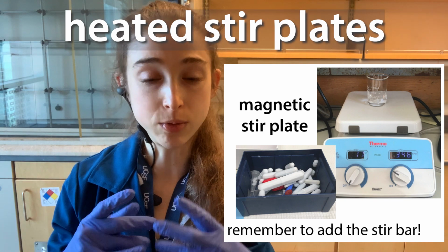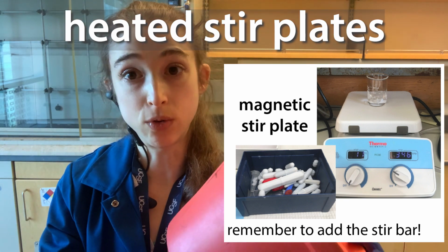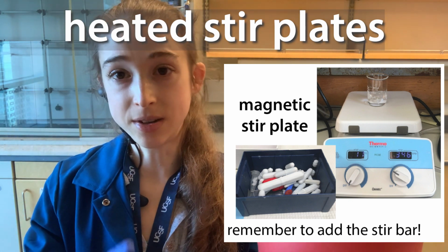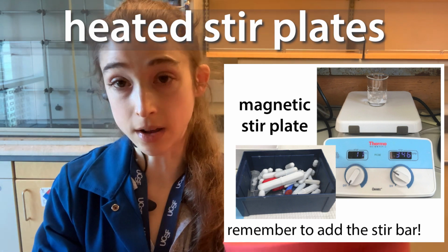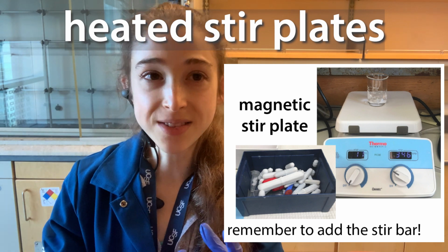Never put something on the hot plate, even if it's off, for storage, or if you're going to walk away and do something. Basically, this thing started a fire. It was not me, but there was a fire that started at my old lab because there was something left on a hot plate. So be really, really careful with that. That aside, these plates can be really, really helpful. So don't be scared of them, just use them responsibly.